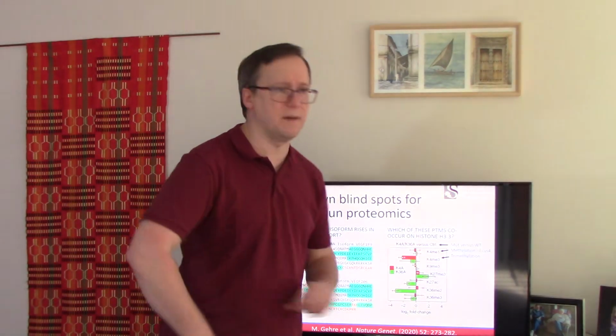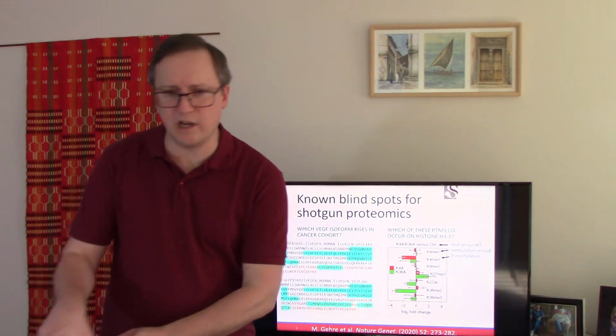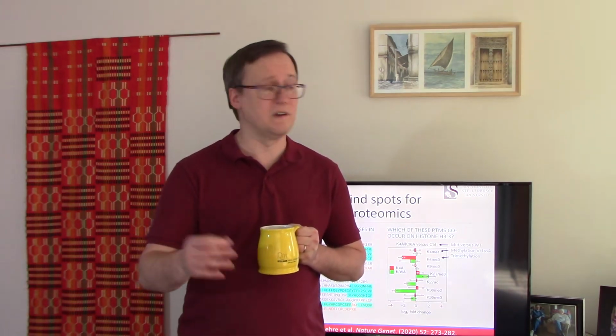Okay, next up, post-translational modifications. When we work in shotgun proteomics, we frequently make a mistaken assumption, which is that each post-translational modification is independent in its presence or absence compared to all the others on that same protein.